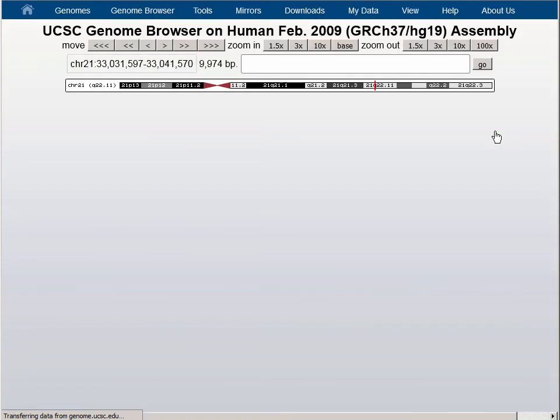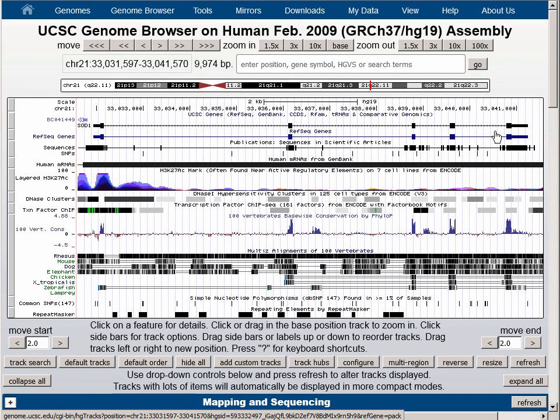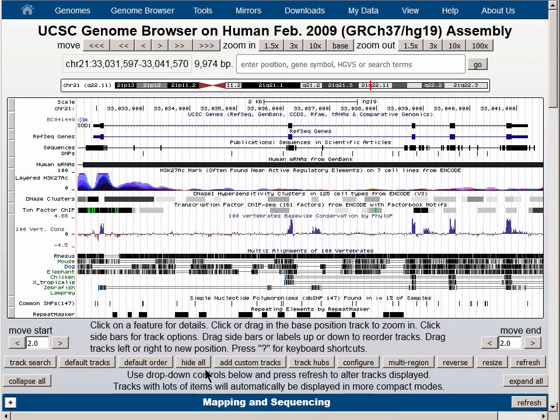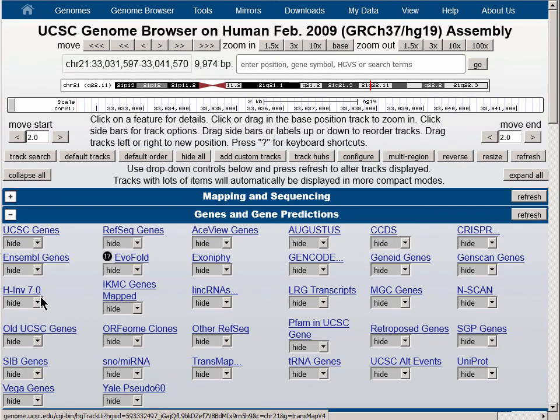Let's reset the browser by hiding all the data tracks using the Hide All button below the browser graphic, and then we'll turn on the UCSC Genes track to pack.